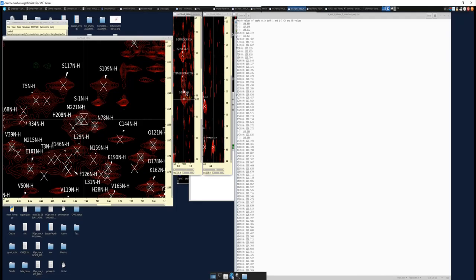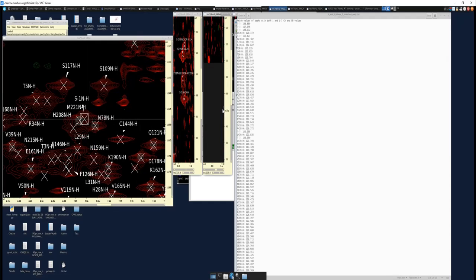All right, so if we go to this one here, we can see in the HNCA, you have 2 C alpha peaks, and you have 2 C beta peaks as well. So this is a good tool if you're starting your assignment and have used up all your glycines and your serines and threonines and are looking for additional anchor points, or you've already assigned a portion of your protein and now you want to see, okay, what's left? Where else can I start?